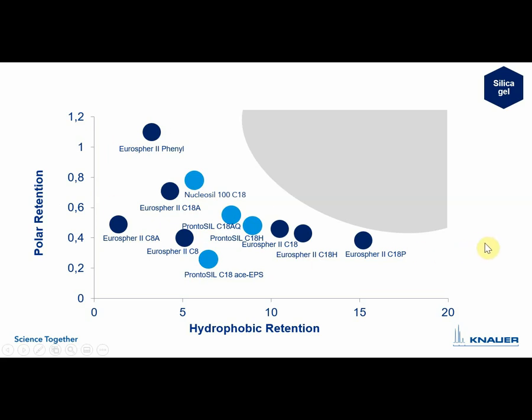It's not to cause confusion for you by offering so many different columns. And all the manufacturers on the market don't put all their columns on the market just to have a new product or just to get attention. It's most often the case that they are filling a gap that is not covered right now.